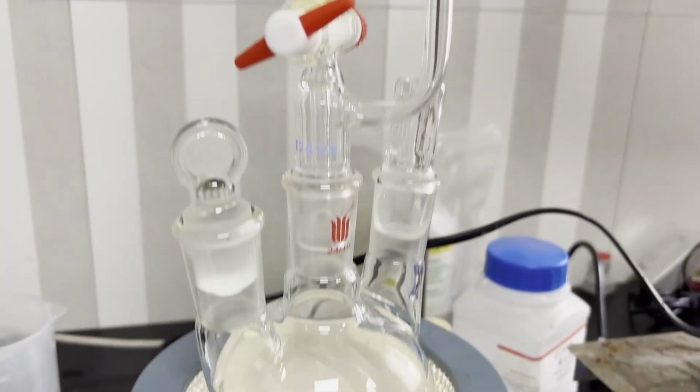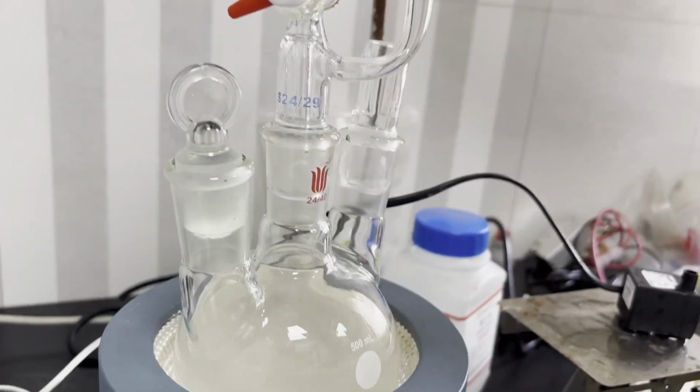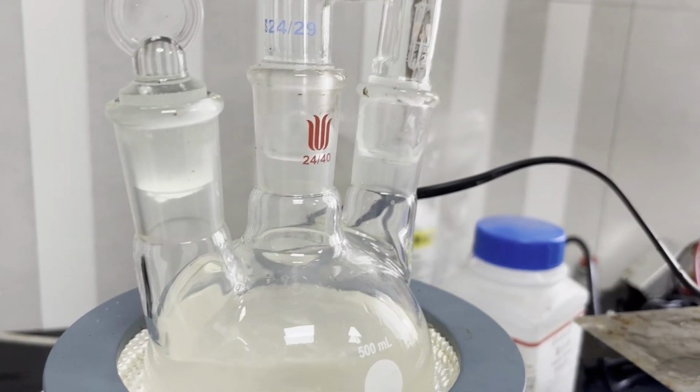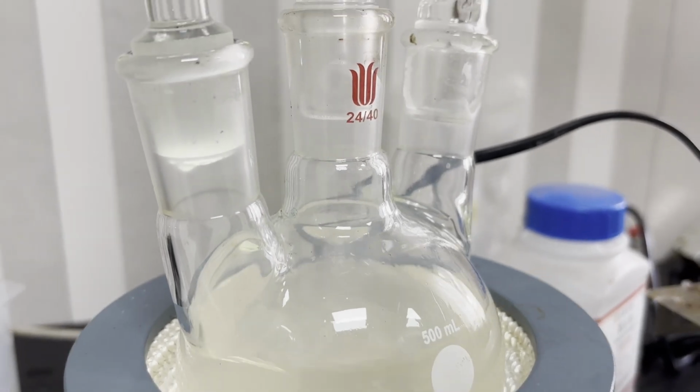A large apparatus is then assembled above the flask, consisting of the same dripping funnel filled with all the N-butyl nitrite and an efficient condenser. The nitrite is dripped rather quickly into the flask, and a white fume of potassium azide immediately appears due to the reaction between N-butyl nitrite and hydrazine in the vapor phase.